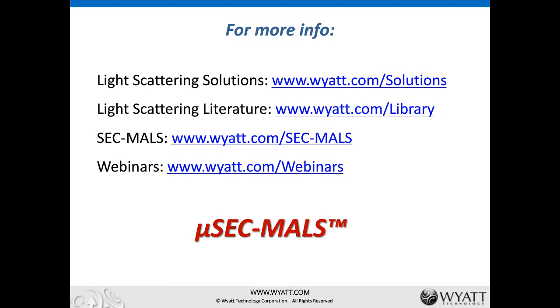Okay. How do you calculate the molecular weight of a pegylated protein? Yes. So it's really the same principle as light scattering. In the slide, we mentioned that we measure the Rayleigh ratio, and then we measure the concentration of the protein from the concentration detector. Since the Rayleigh ratio is proportional to the product of the molar mass and the mass concentration of the protein, then we have one unknown, one equation, we'll be able to figure out the molar mass.